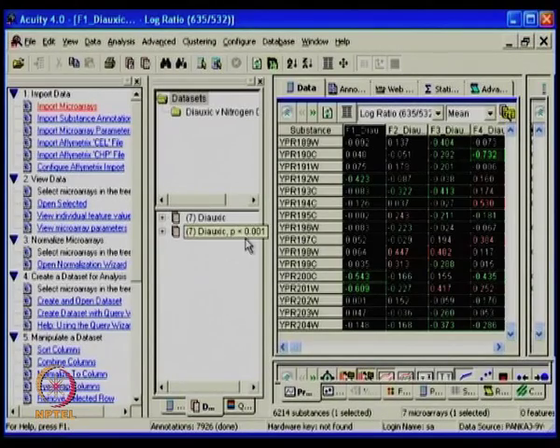So now there are two ways of doing things in the data set. One is to take all the features, and sometimes people say I want to have my criteria defined such that my visualization makes more sense to me. So maybe one can be stringent at this stage itself and say, okay, I want only very biologically significant ones. True. Define the p-values. True. And then just sort data based on that. So people can select changes up and down within a range, which is twofold up-regulated, twofold down-regulated.